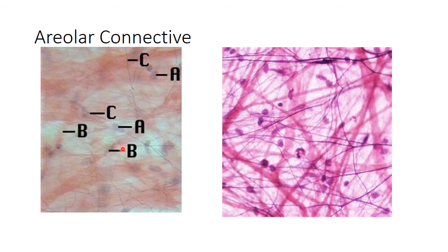With this one, what you're seeing now with connective tissues is all these fibers in here, and all these different cells. See, that's a macrophage. You can see this thing right there is a fibroblast. They make the fibers. See these red fibers? Collagen. What do they teach about collagen? Like a strong bungee cord, right? See these little fine hairs? Those are elastic connective tissue.